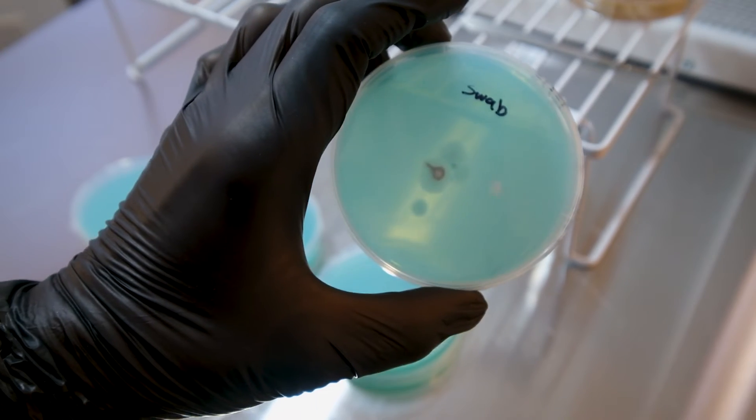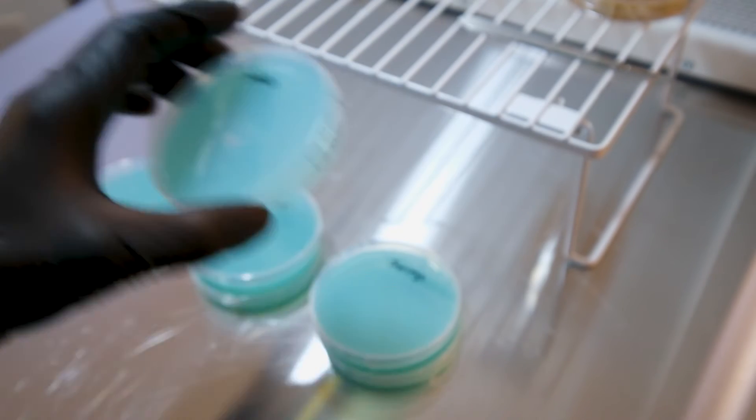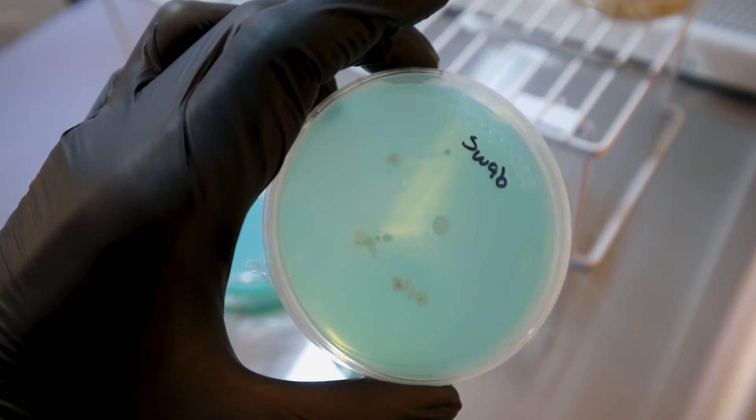On to the swab — this one's germinating nicely, lots of great growth there, it's really fast. And then the whole reason we put the stuff to agar first is because this next one — that is not mycelium, that is all bacteria.